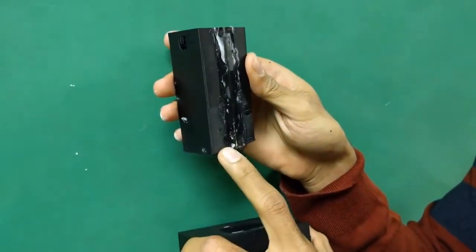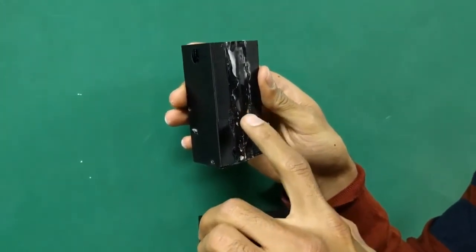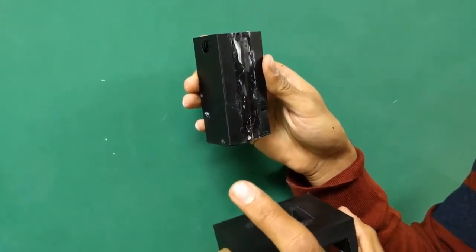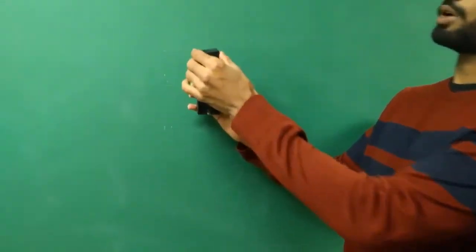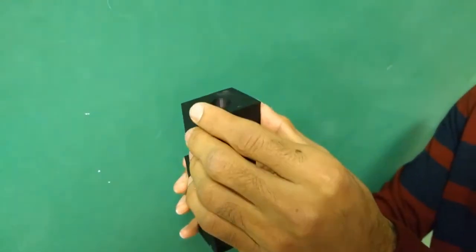Here you see a plastic strip. This lets us see how high the liquid is in the chamber. This is so that we don't have to make volume versus height comparisons, and we can just do that using the apparatus. Finally, on top of the liquid holding column, we have the laser holder.